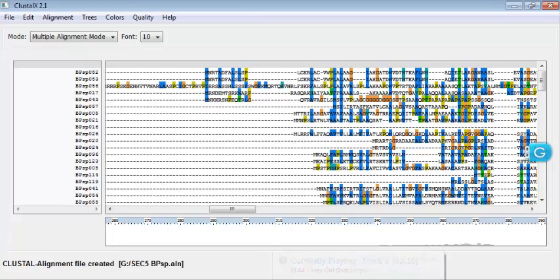So now we are finished with the BPSP file as well. I hope you can get the steps clearly, and I hope you can understand how to use these tools, and also my previous video to get protein structures and protein sequence, as well as nucleotide sequence. So good luck in doing your assignments, and thank you. I hope you enjoy the video.